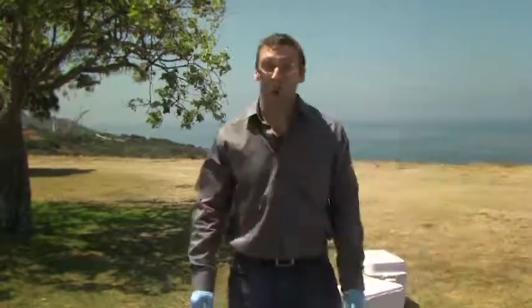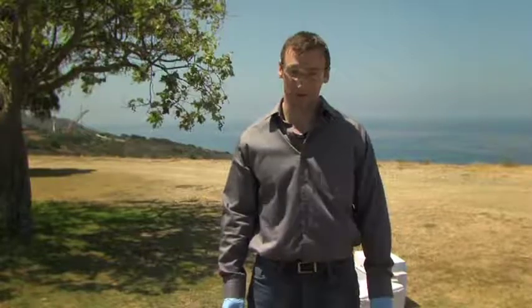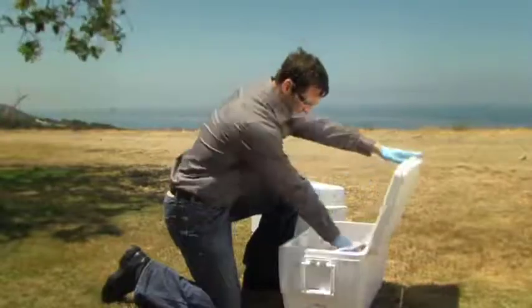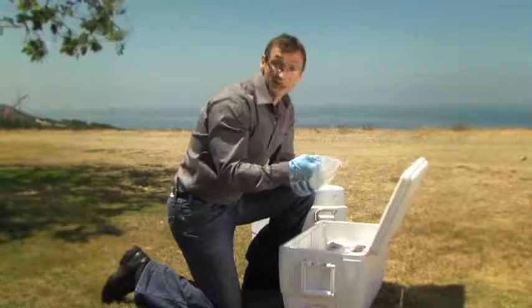During the Environmental Quality Sampling course, you've been learning how to properly collect samples and fill out the chain of custody. Now we're going to follow what happens to these samples when they arrive at the laboratory. These soil samples are to be analyzed for lead.